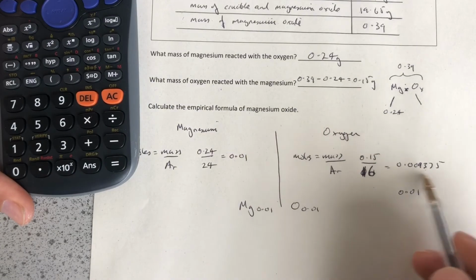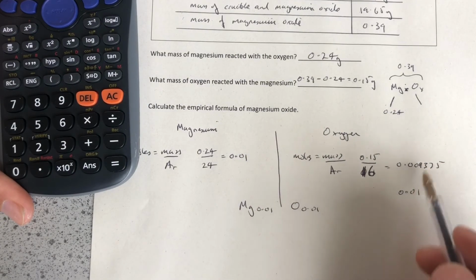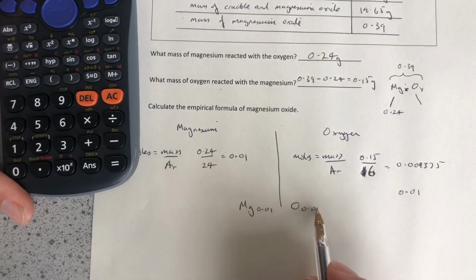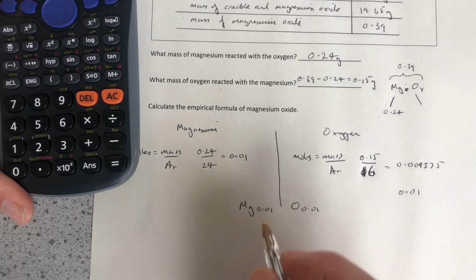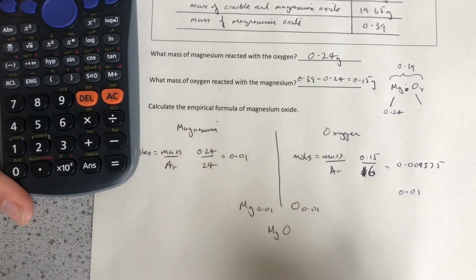We shouldn't be surprised we've got a strange, quite hard to deal with number here, and rounding it I think in this case is fine because it is very, very close to that. And that then makes those two numbers identical. Neither of them is bigger, therefore the empirical formula is MgO, because we're looking at the relationship between these numbers.